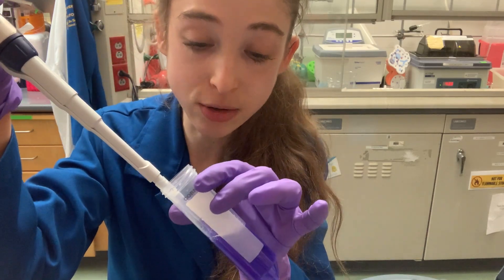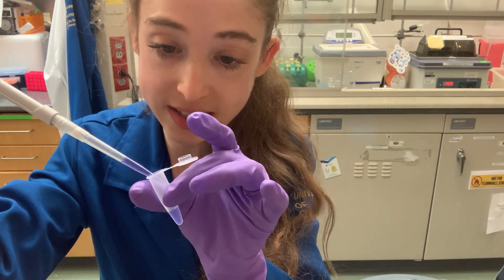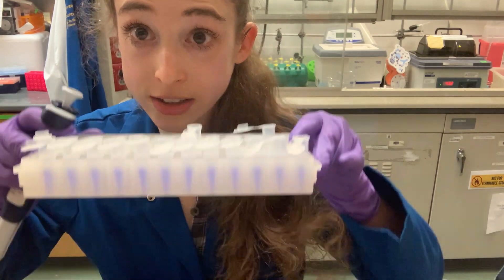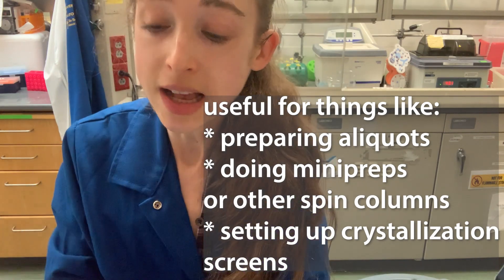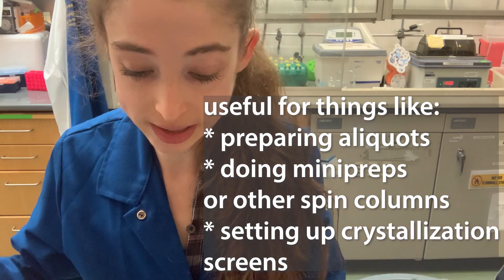With a normal pipette, you aspirate a single time, a single volume, and then you dispense once — a single time, a single volume. But what if you have a lot of tubes and you want them all to have the same volume? Here's where the repeater pipette comes in really, really handy.